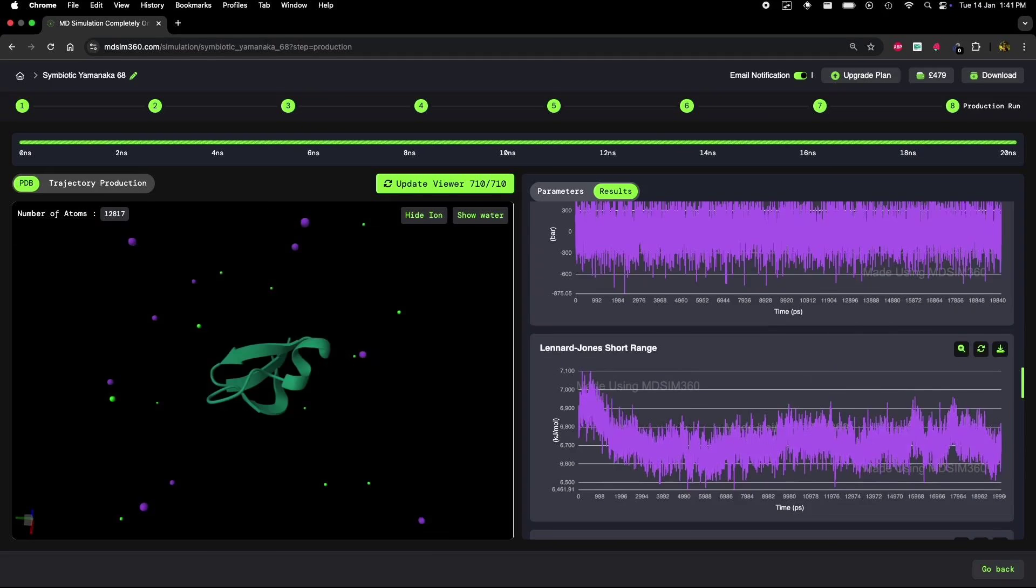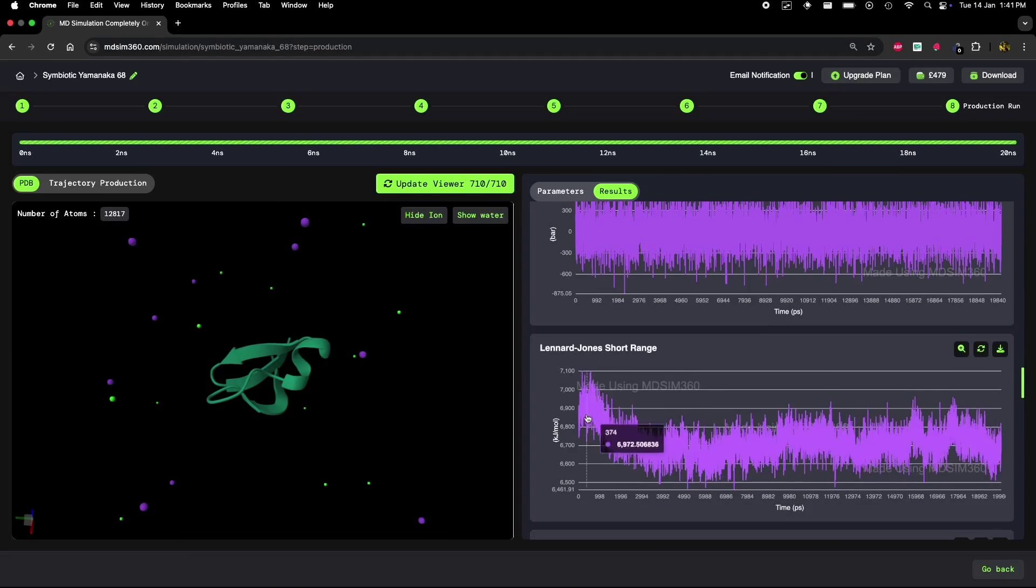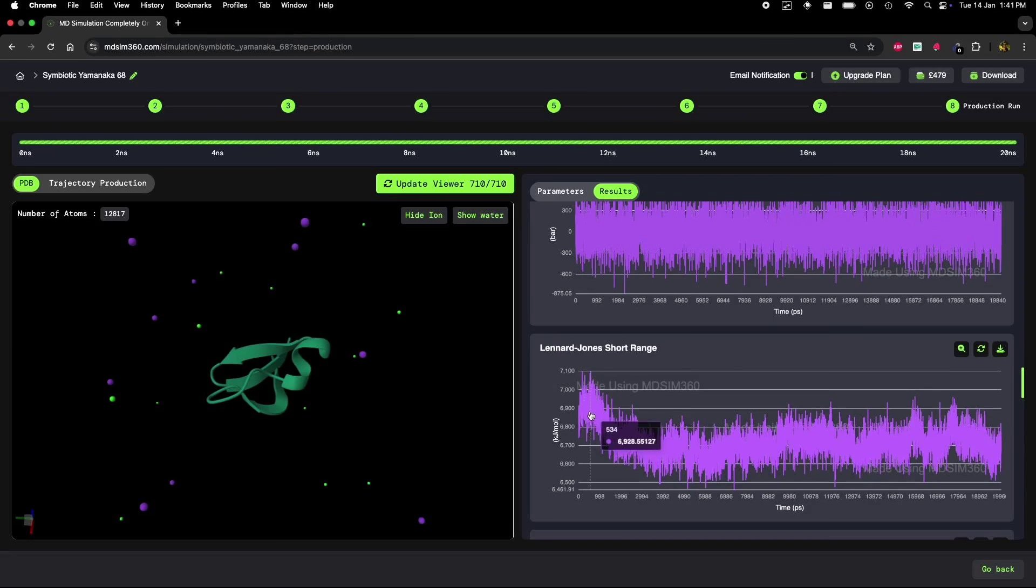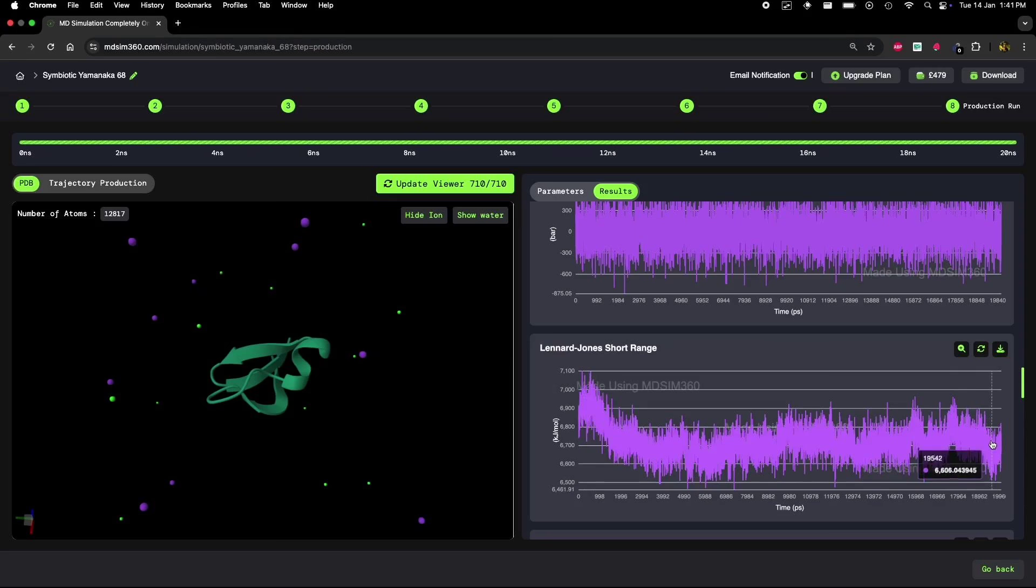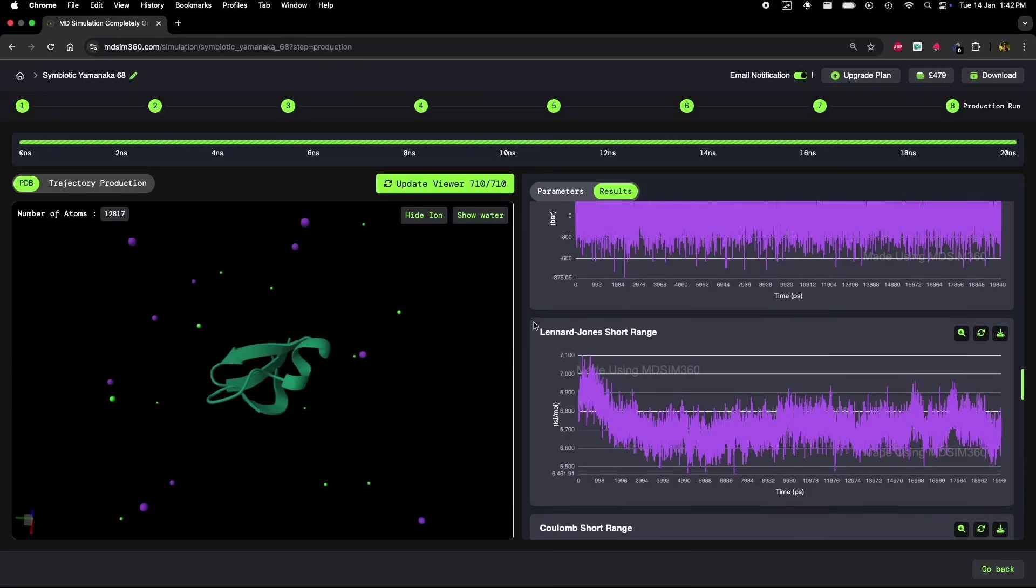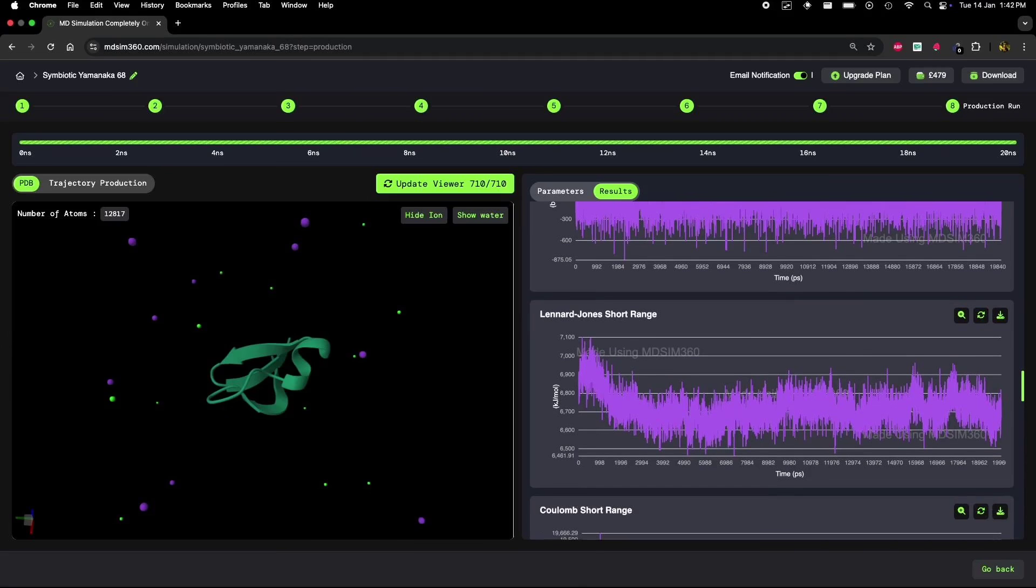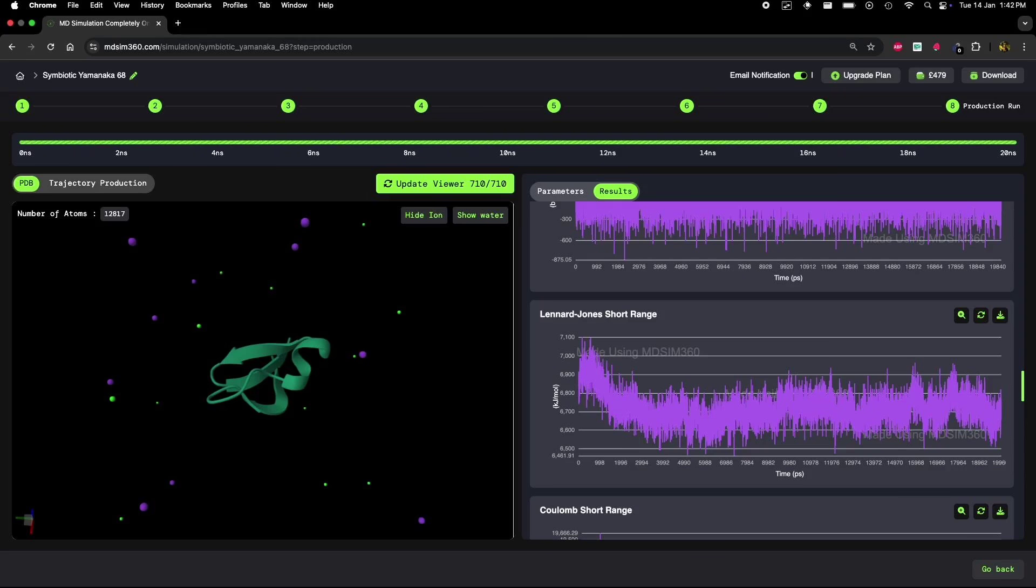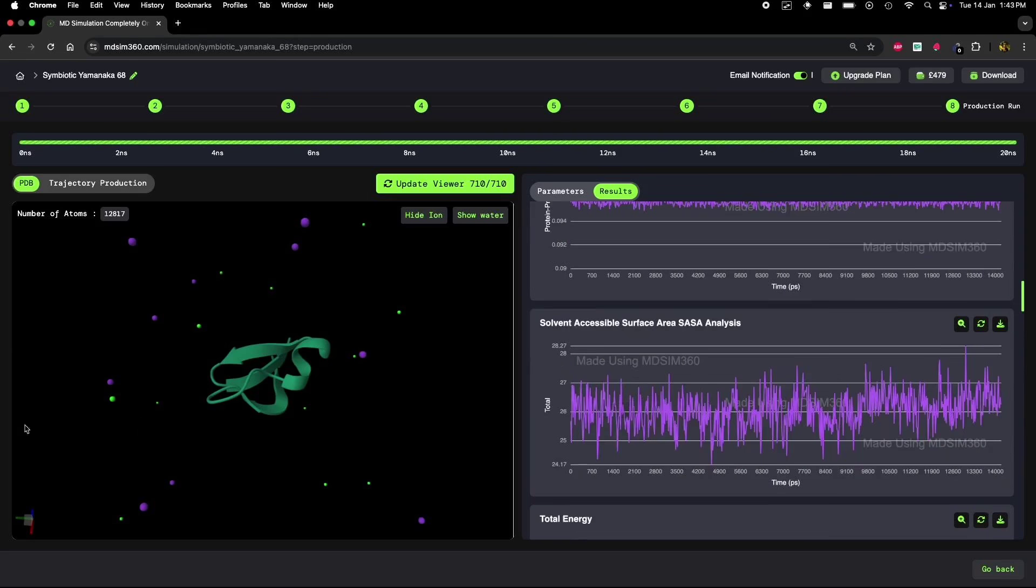Let's now look at the Lennard-Jones short-range interaction analysis. This analysis examines van der Waals interactions between atoms in the protein and nearby molecules. These interactions are crucial for maintaining the hydrophobic core of the protein. The graph shows a slight decrease in these interactions over time. A drop in Lennard-Jones interactions often suggests that the protein's compact structure is breaking down, which again points to unfolding or a loss of stability in the protein's core.